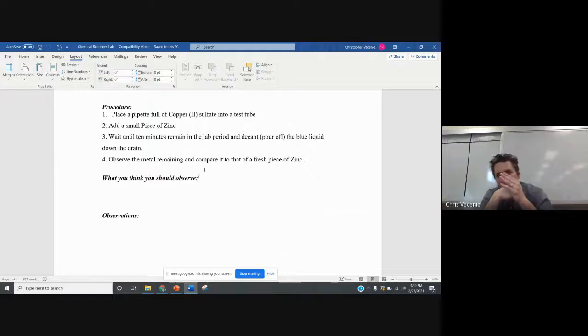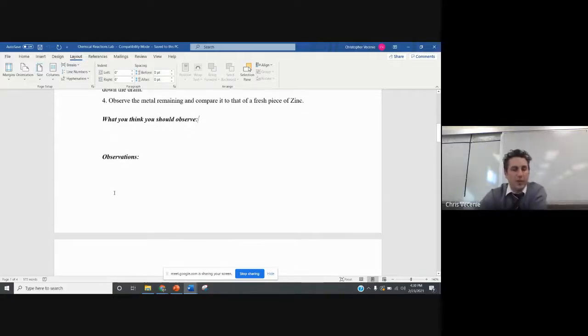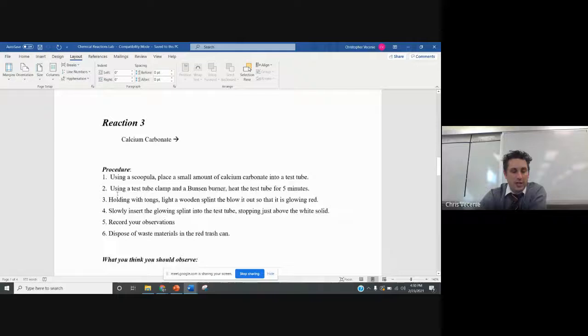Don't say that I had the formation of a precipitate. You would make an observation: hey, there's a white solid on the bottom of the container. So that's what's going on with your observations. I'll help you with those as I conduct the experiment.